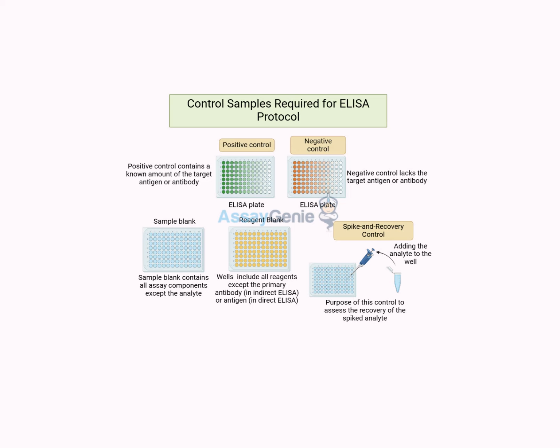Okay, so imagine you're a detective, right? And you're trying to find this tiny little clue at a crime scene. You need a tool that's incredibly sensitive and really specific. That's kind of what ELISA is in the world of molecules. Yeah. We're going deep into ELISA controls today, specifically why they're so crucial for accurate results.